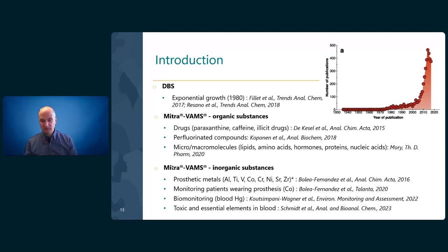Then a second paper by the same group was used for cobalt measurement in patients with prosthesis. So this method has actually been applied to real patients.